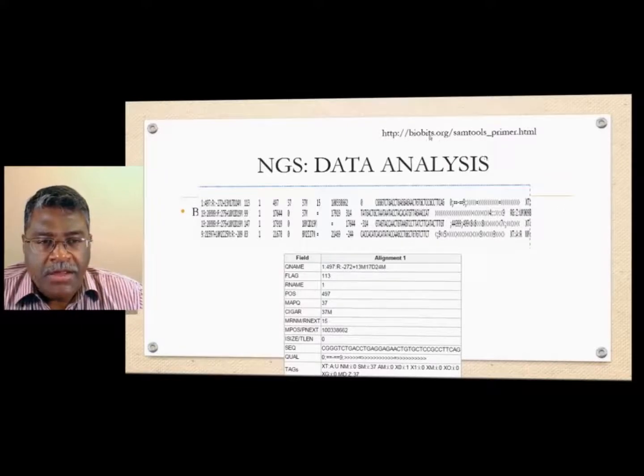So in terms of the next generation sequencing data analysis, what we are looking at is, for example, these results, and this is a very useful link. It teaches us various tools that allow us to interpret the results.